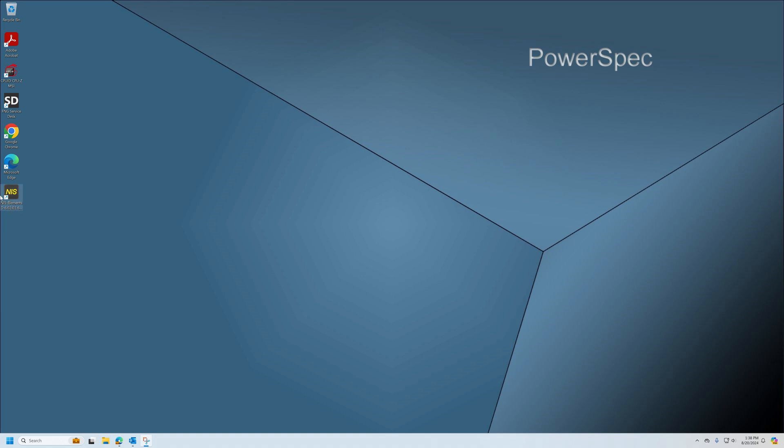Prior to starting the Elements software, which is seen here on the desktop icon, make sure that the microscope and the camera and the external lighting controls are all powered on and that you wait maybe 10 seconds or so for the camera to fully load before you start the software.